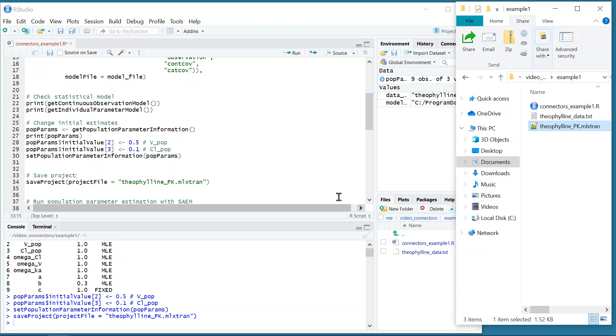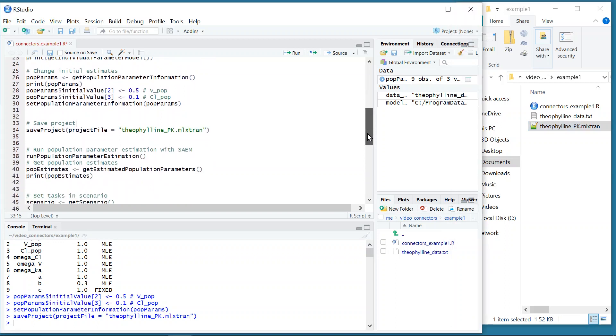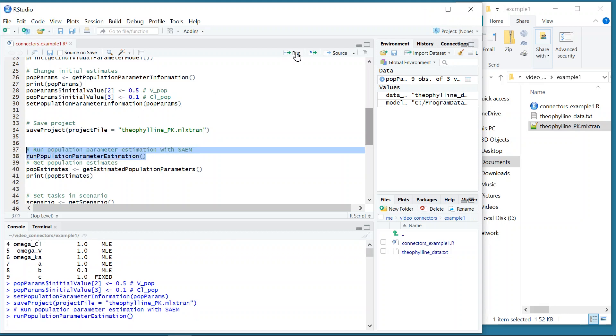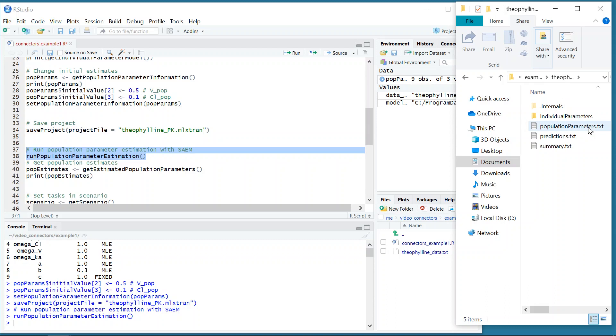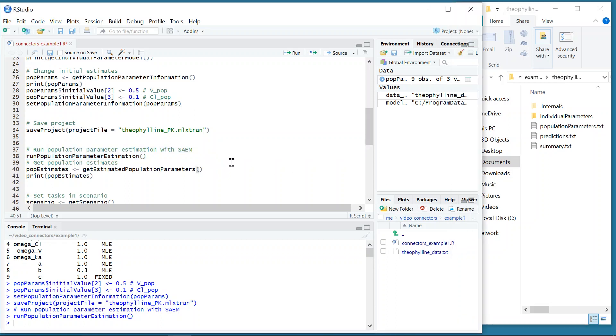I can then run the population parameter estimation with the SAEM algorithm with the function runPopulationParameterEstimation. It is equivalent to clicking on the task Population Parameter Estimation of the interface. I see that a result folder has been created next to the project that contains the file of population parameters. I can read the estimates in R from this file, but it is simpler to use the function getEstimatedPopulationParameters and print the result.